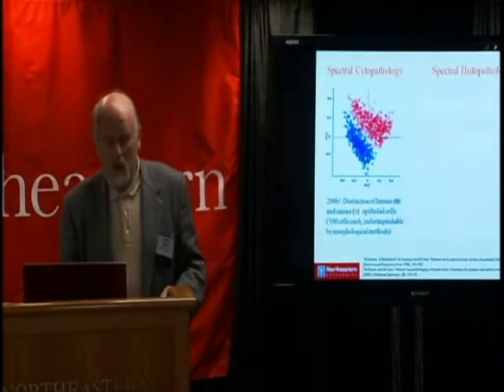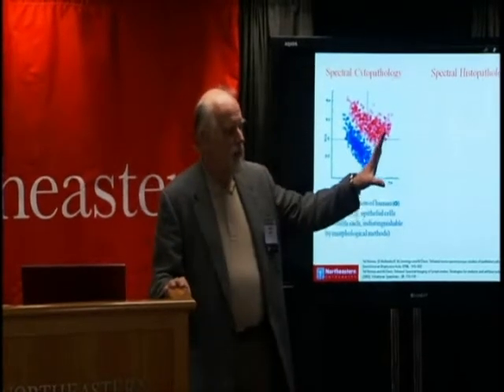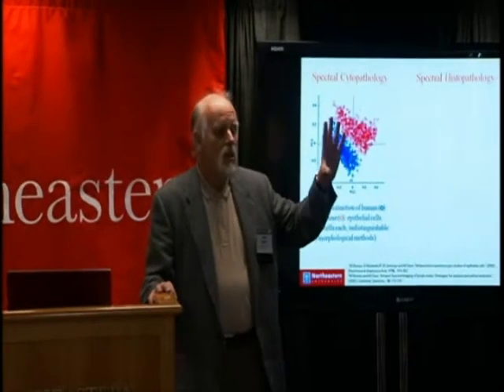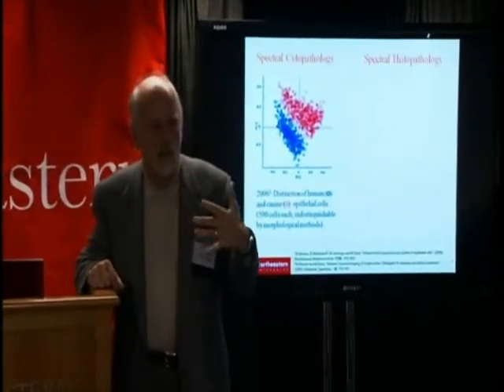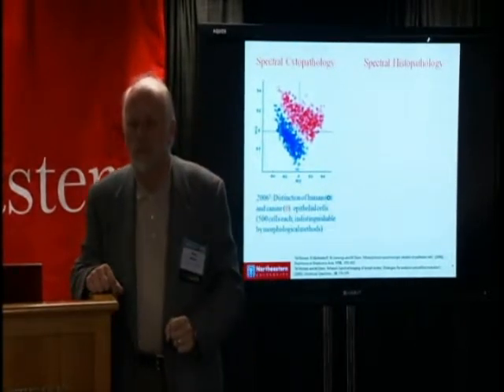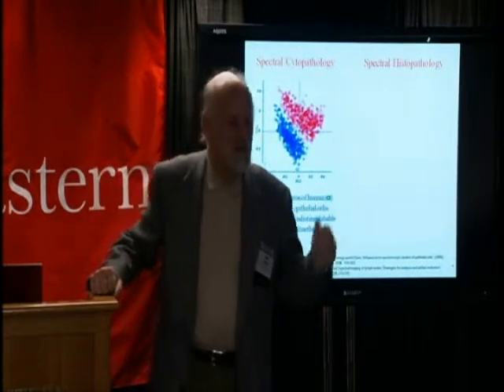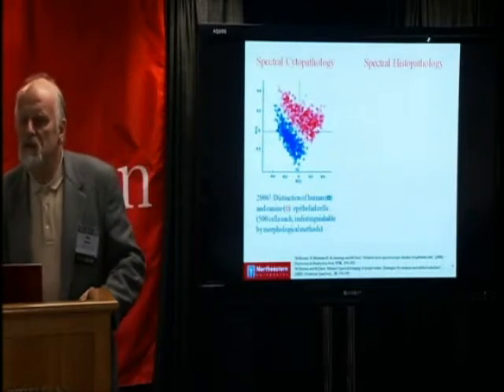And that was actually our first very, very exciting result. We have here samples from canine cells and human cells. No cytologist in the world could visually distinguish them. They look absolutely identical. I mean, a dog, after all, is a mammal and is a relatively close relative of ours, okay? And we could distinguish them.